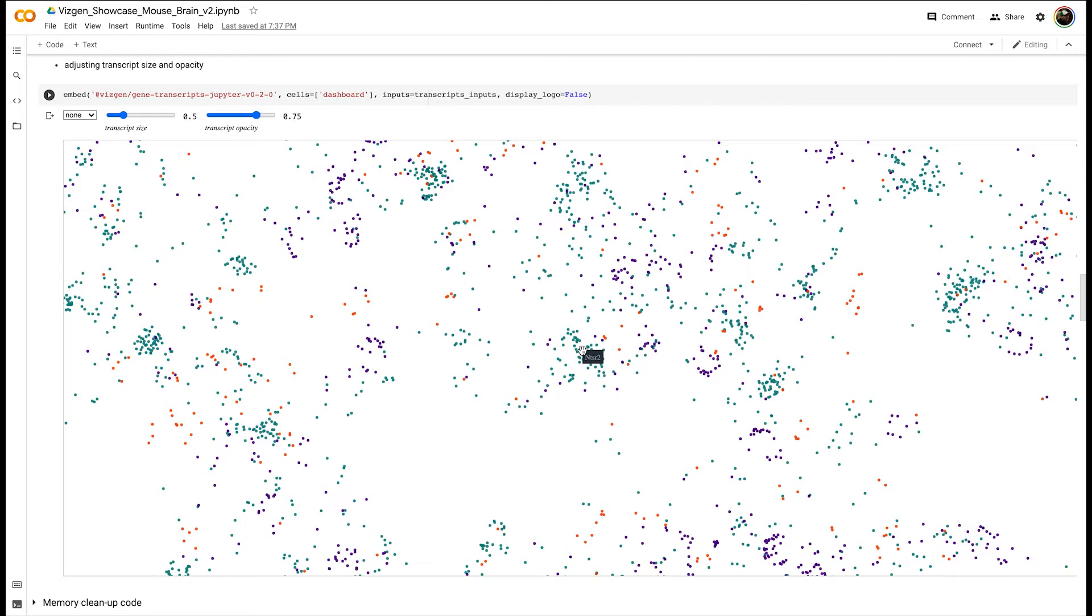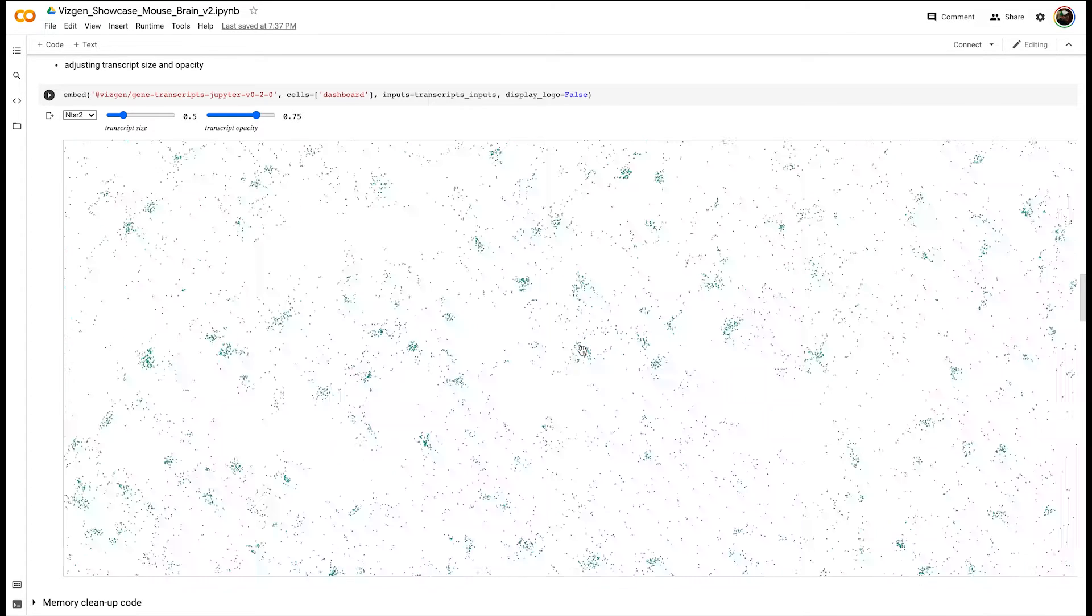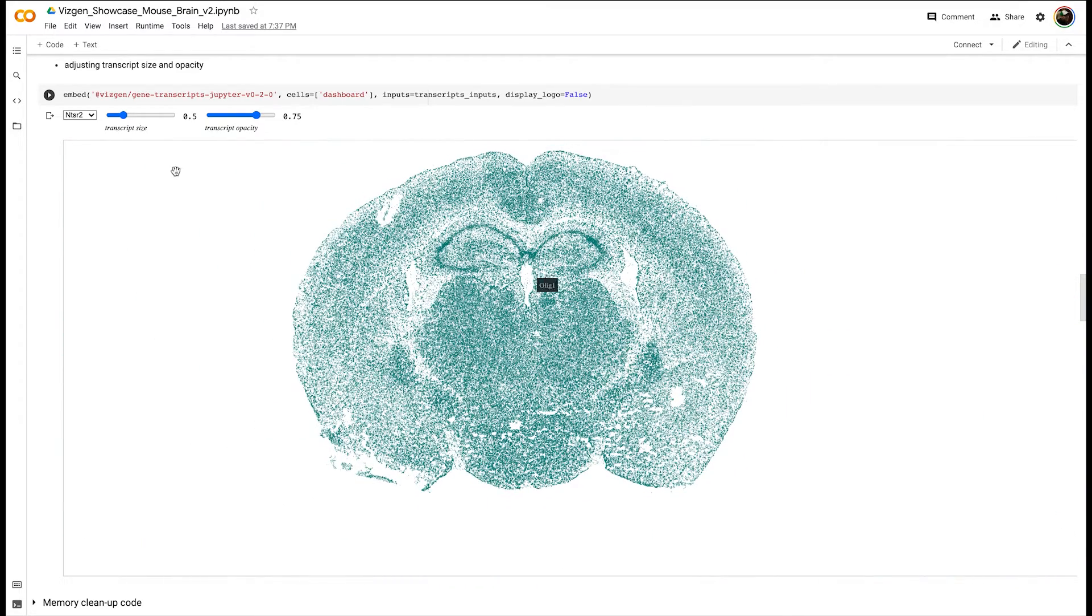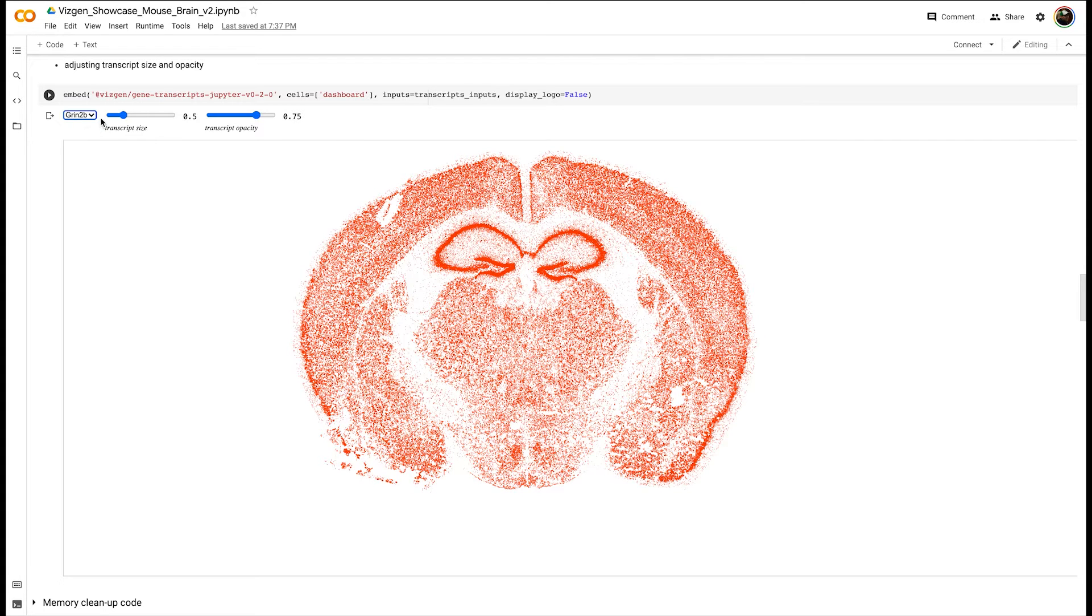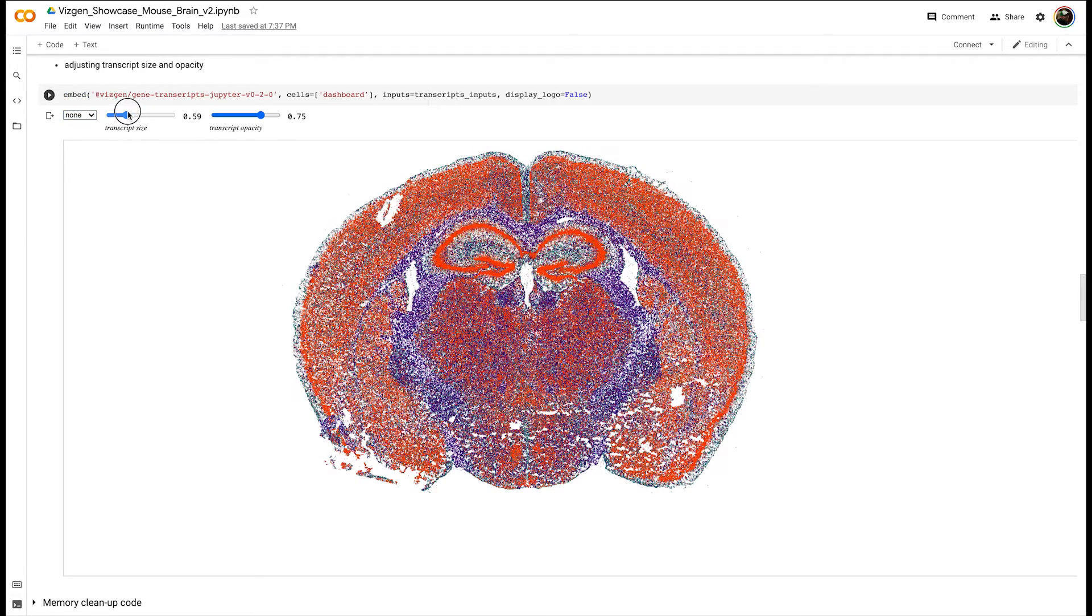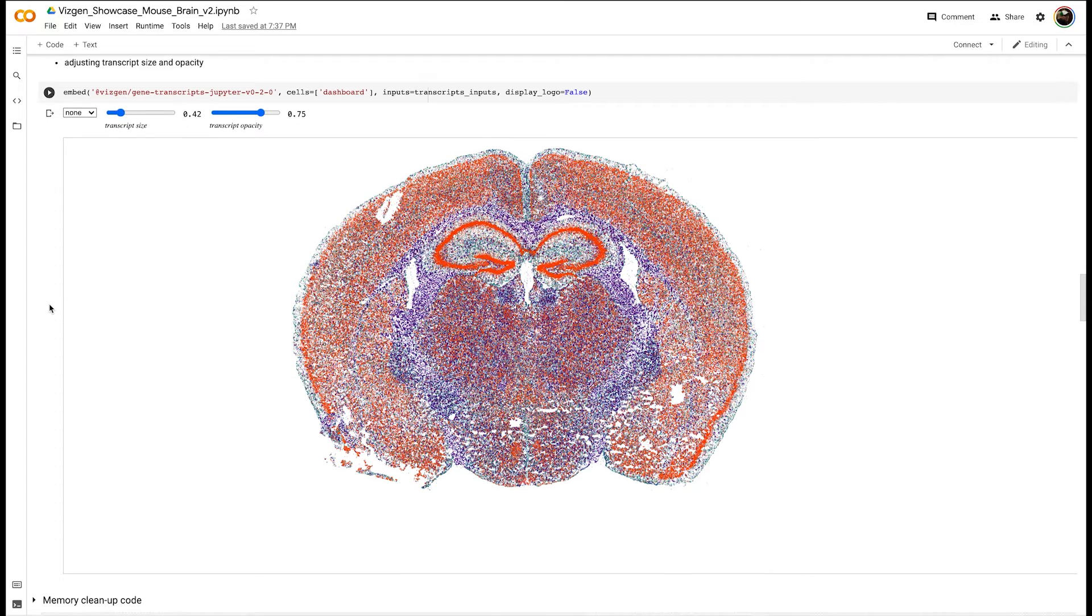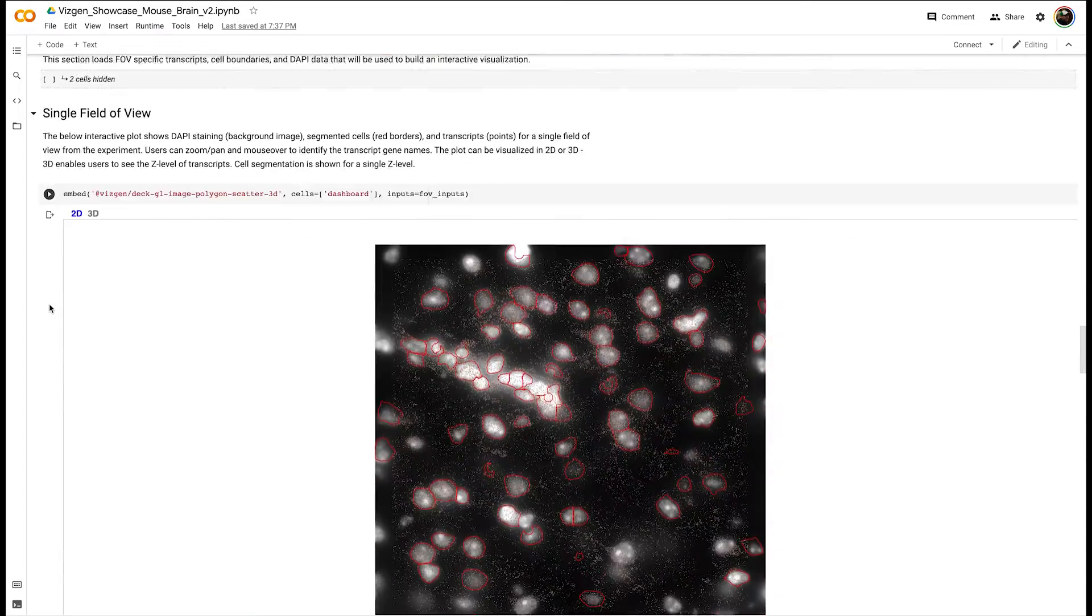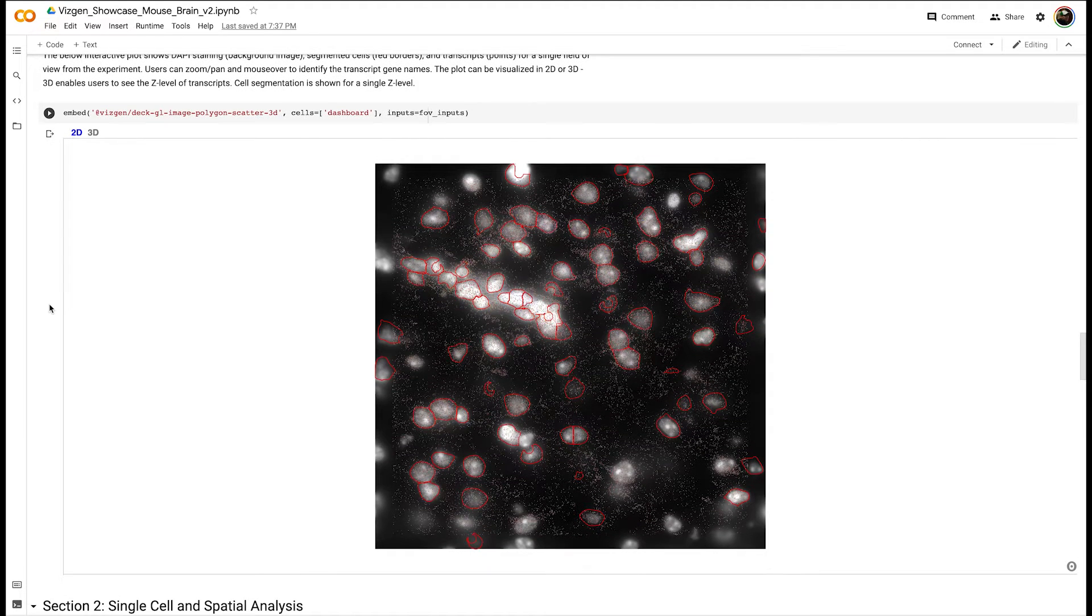You can mouse over to see the gene name. You can click to highlight a particular gene of interest or a single gene from your list of genes of interest. You can also use the drop down menu to select the gene of interest, and you can adjust transcript size to help you see the patterns better in your data.